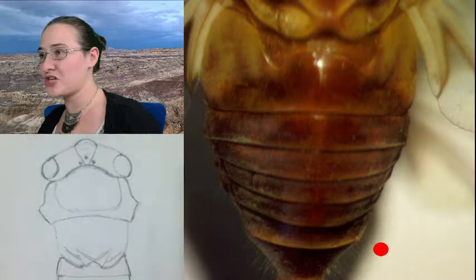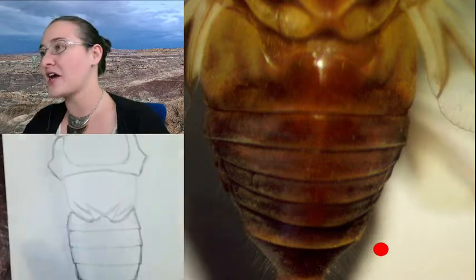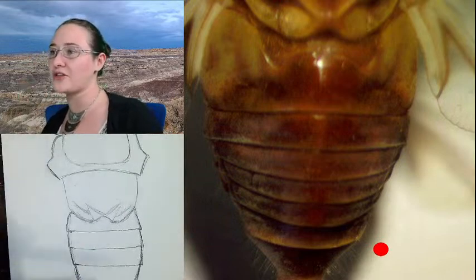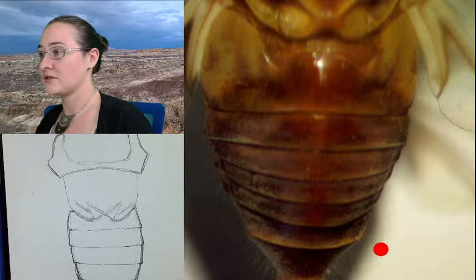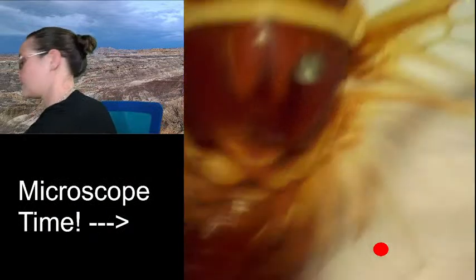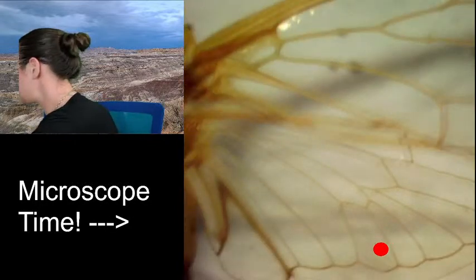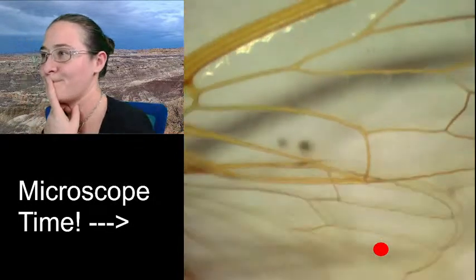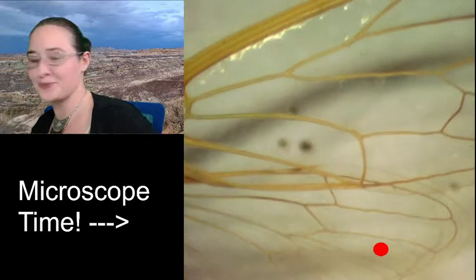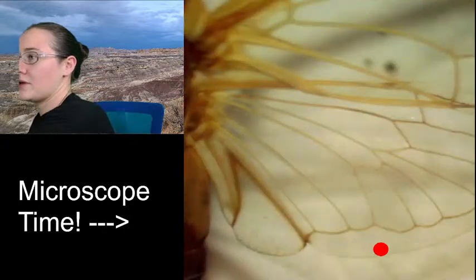What I figure is I'm going to draw this right side with its wing open, and then I'm going to pull another specimen, and we can look at what it looks like with the wing on the left side closed. This is as far out as I can zoom. Here, this is what I can do.